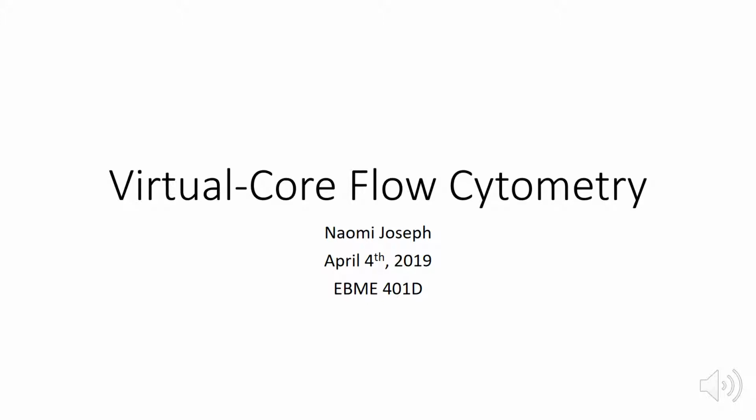I'm going to start off with a brief background in the history of flow cytometry, talk about the problem statement they were trying to solve, what the approach was that they took, the results that they collected, and conclusion from this paper.